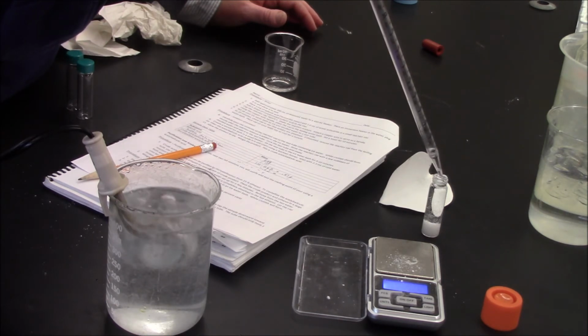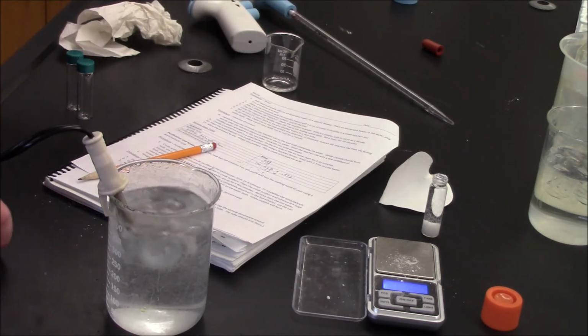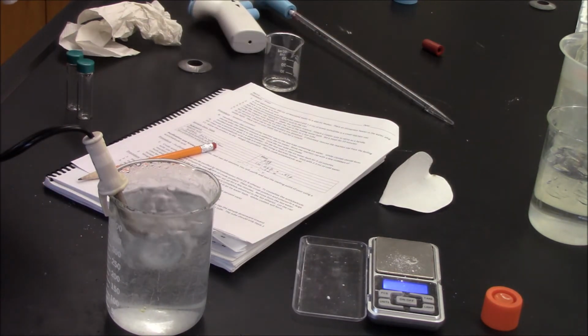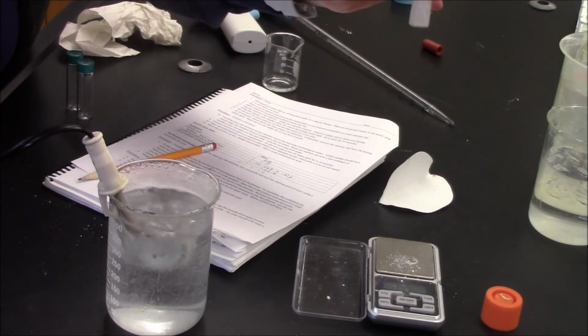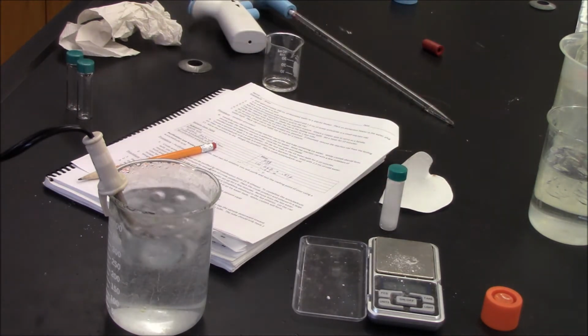Once I've added my 8 milliliters of the 25% ethanol solution, I tightly cap the reaction vial, invert it a few times, and then attach my copper wire handle so that I can heat this mixture in order to get my crude product to dissolve.